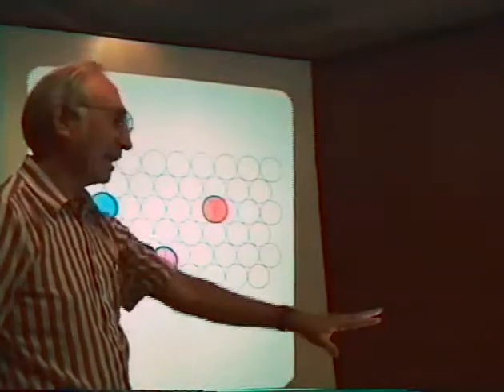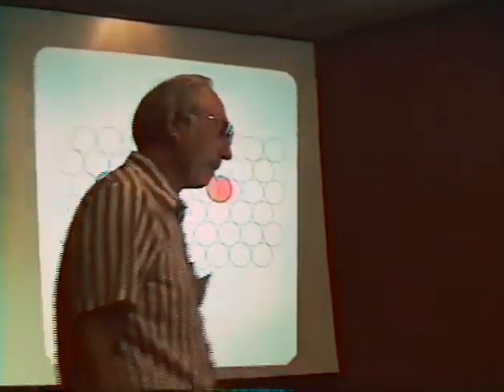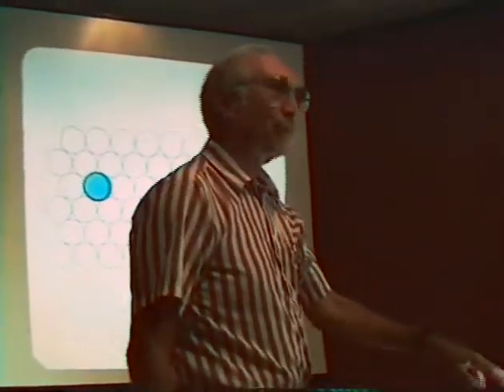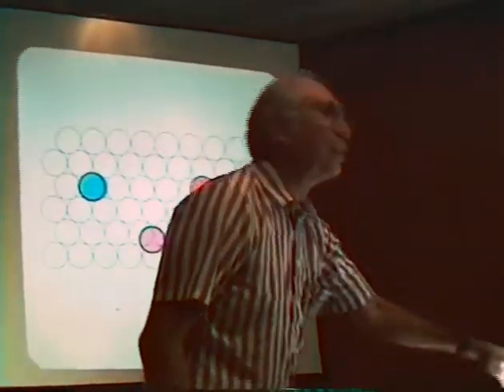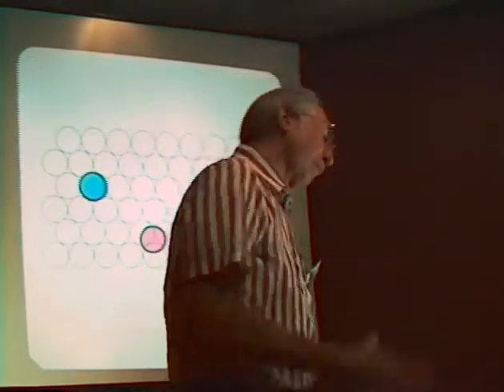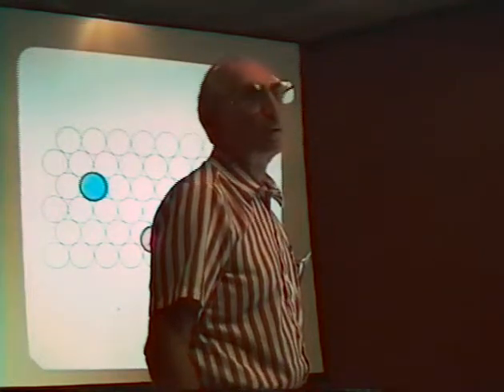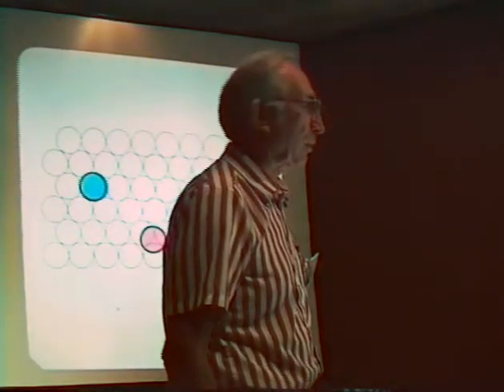Now, something that I'm going to emphasize as I discuss several of these effects is the magnitudes of the differences. These 3 kinds of bonding situations give bands in positions that differ by about 100 wave numbers, 100 reciprocal centimeters.